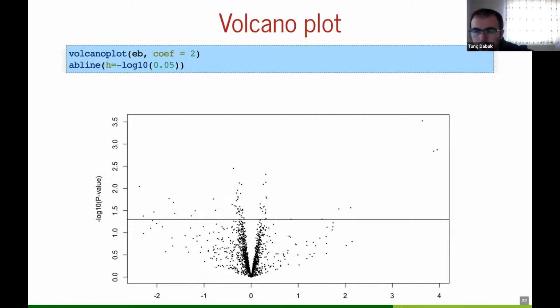I might have one. Every point represents a gene here, and these are p-values. As we know now, one or more of these genes are going to go below the threshold if we take the adjusted p-value. So is it a bad idea or a good idea to show the adjusted p-value or the p-value in the plot? Which one should we interpret?